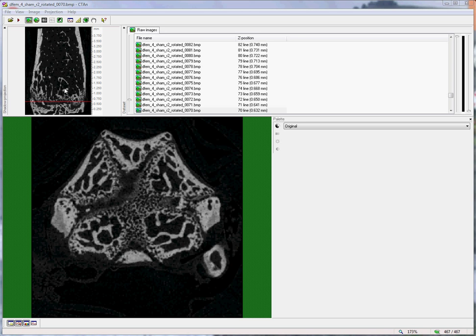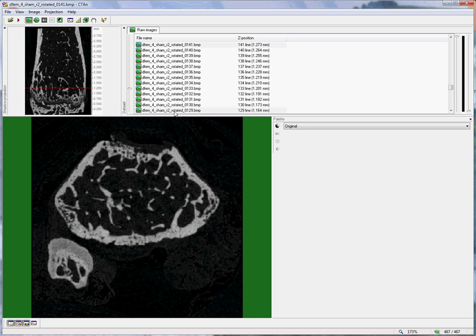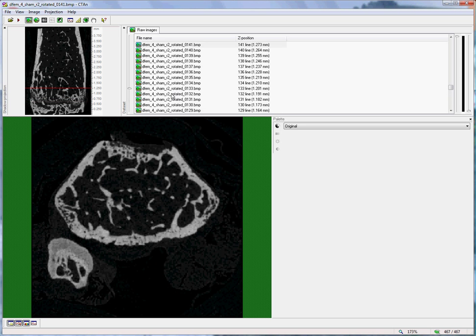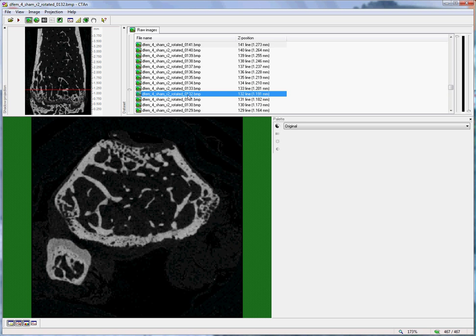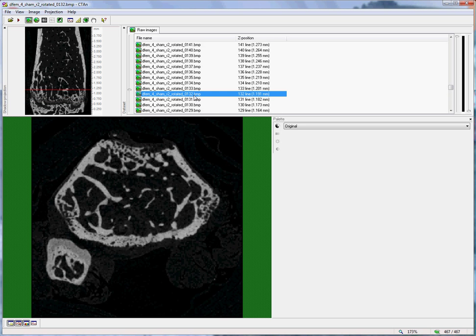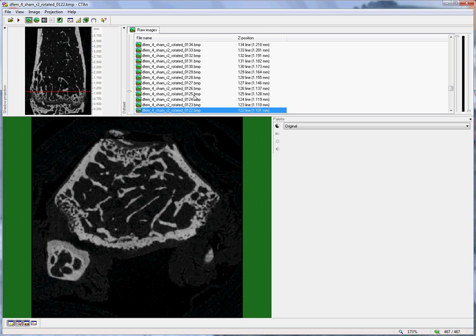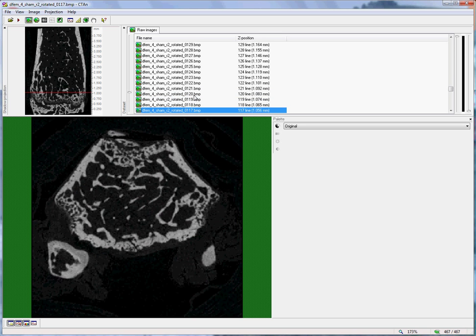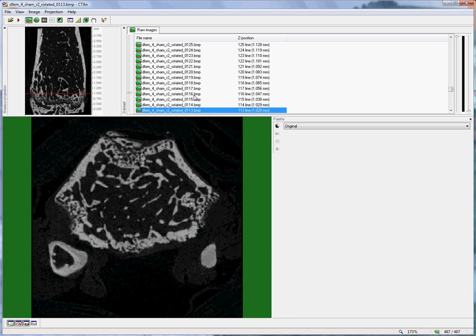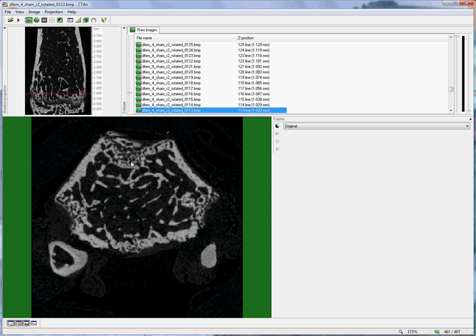If I begin in the metaphyseal trabecular region and move towards the growth plate, for example just using the keyboard arrow to move down slice by slice, one begins to see at the periphery of the bone structures of primary spongiosa as we approach the growth plate.